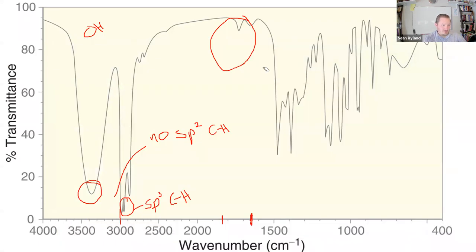It's definitely something where if you do have a really good pure sample and you take a scan of it, you can either just match it up, or there's software that will actually go through a database and look at these different peaks and say, okay, peaks at these six different wavelengths, that's definitely phenol or 2-butanol or whatever it is. Right, so that's the primary data interpretation and analysis that you guys are going to have to do for this.